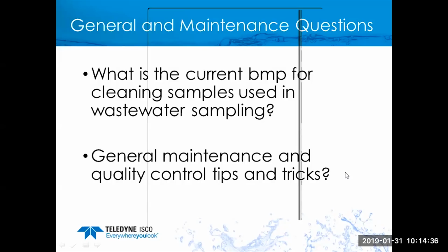And there's really no one right way to do it. There are multiple ways you can approach it, but there is one thing I would put out there. It is best, if you can, to have the sampler itself mounted in an elevated position above the source.